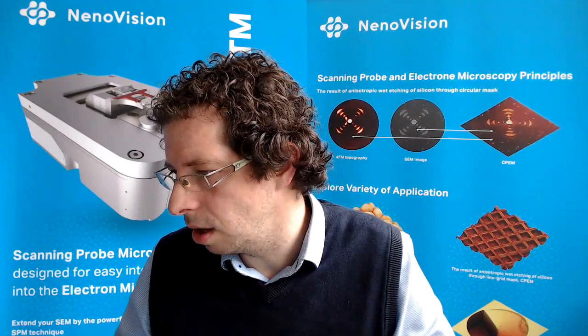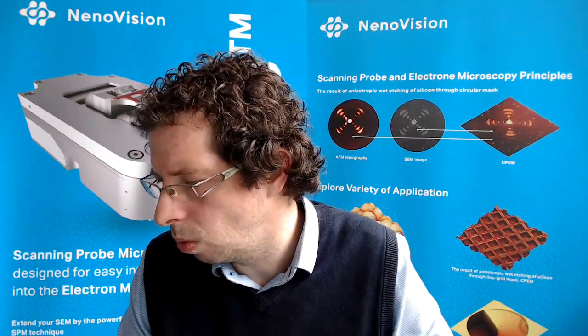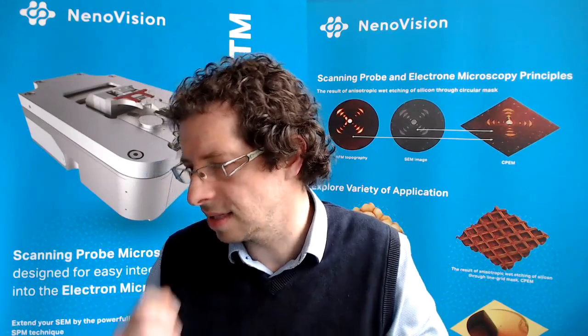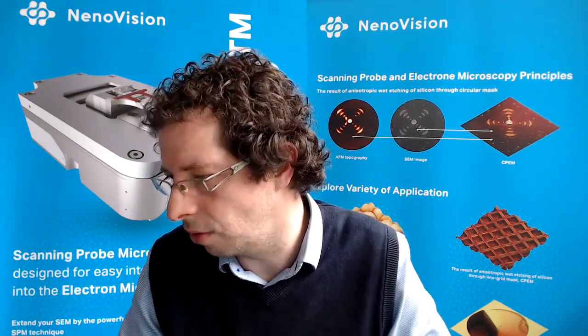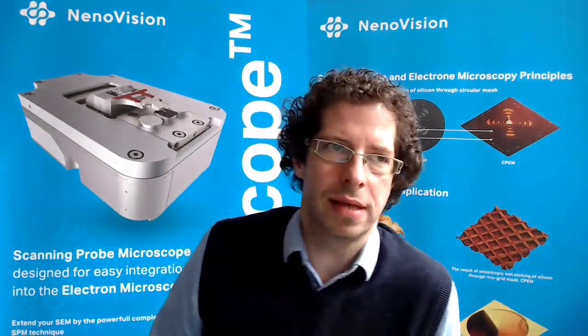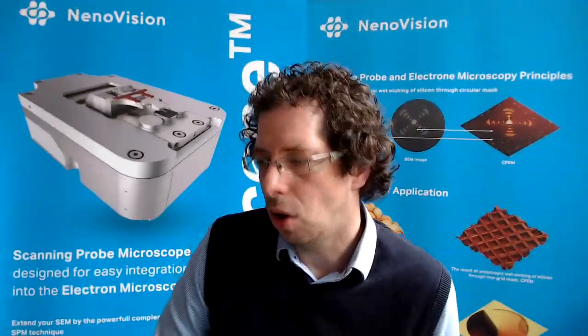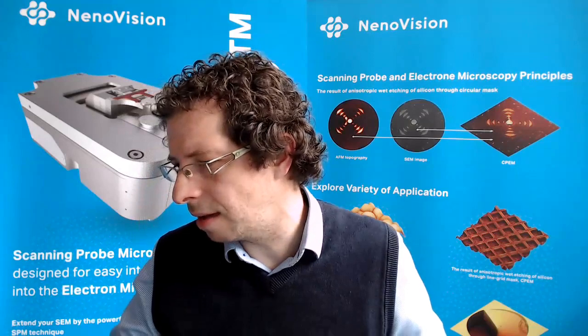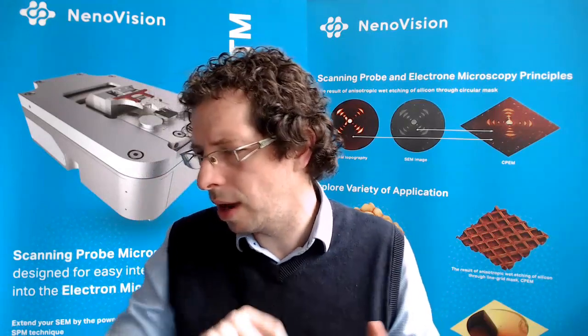I have a question. What is the maximum weight and size of the sample which you can place on the scanner? The maximum weight is 100 grams, and the area where we are able to scan is about 2 centimeters by 1 centimeter.